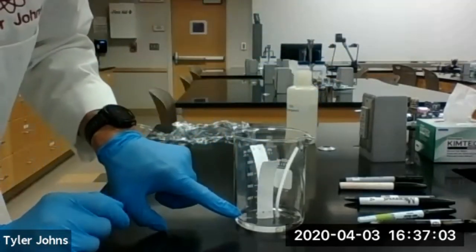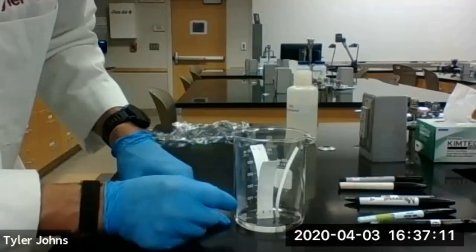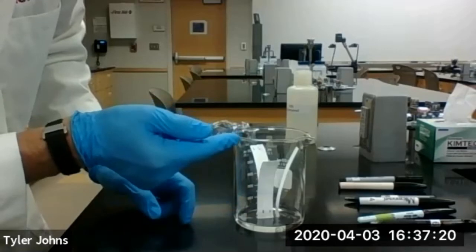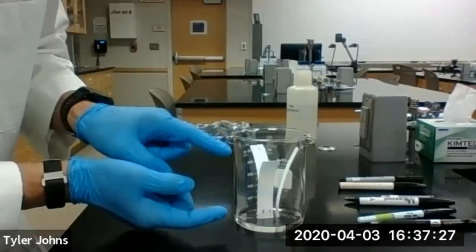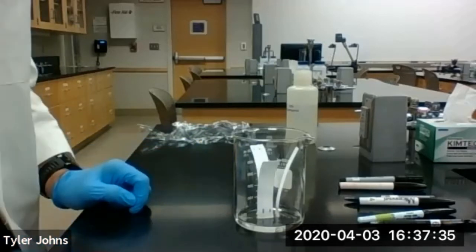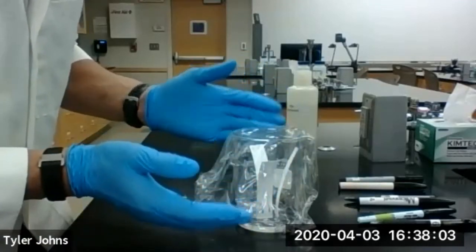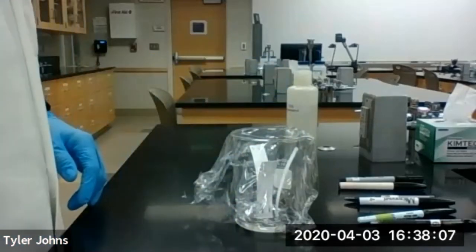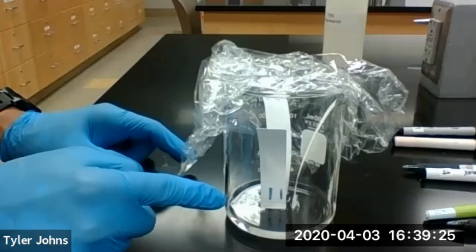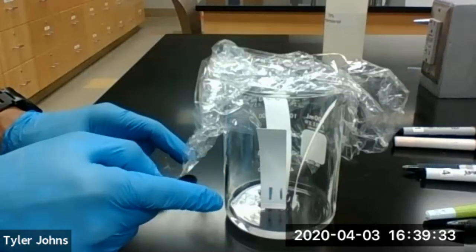The chromatography paper is going to allow the solvent to migrate up it, and as it does that the ink on the pen is going to separate out. Various components, various chemicals in the ink, are going to migrate either faster or slower up the chromatography paper. We're also going to cover our development chamber with a piece of saran wrap so that the 70% isopropanol saturates the whole chamber. You should be able to see here that our ink from our pens is starting to migrate up the chromatography paper along with our 70% isopropanol solvent.